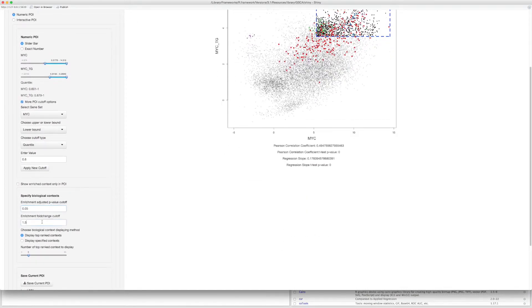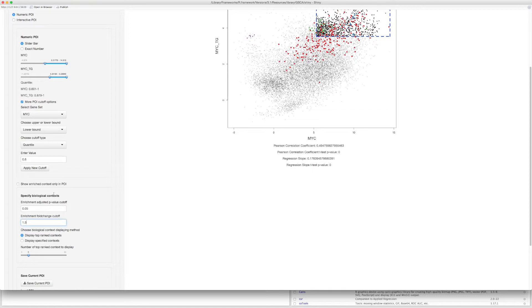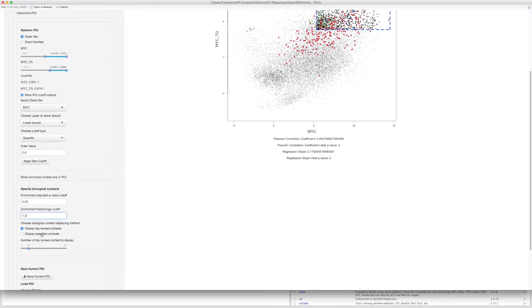The number of enriched biological contexts will change. You can also specify what particular biological context to display in the plot.